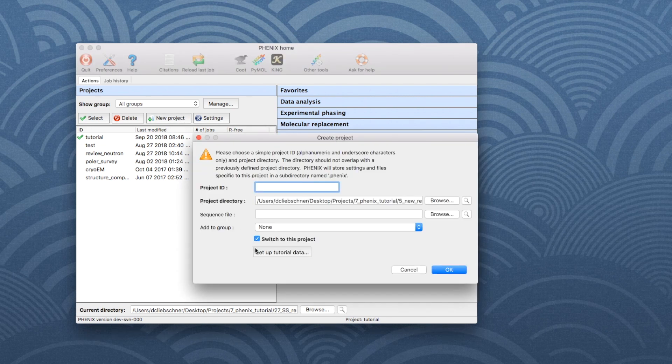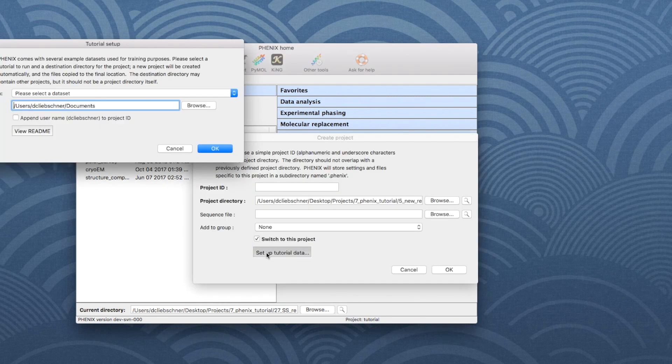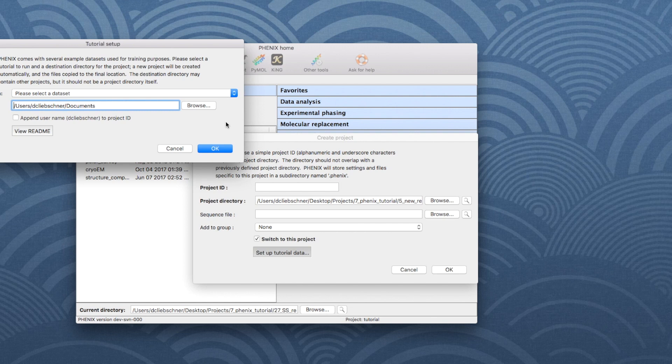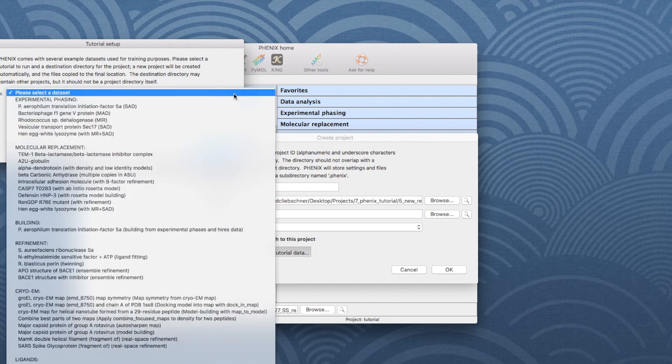Then, click on Setup Tutorial Data. In the new window, click on the Tutorial Data drop-down menu.